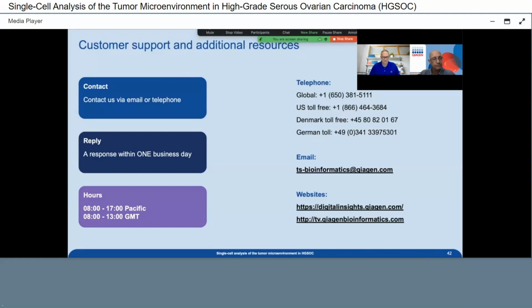Great. Okay. And then another question: can the general processes for comparing and contextualizing be applied to normal bulk RNA-seq data, or is that only for single cell data? Absolutely, for any type of data. This is an example of single cell because it's particularly trivial, particularly complicated, but we have done that many times for bulk RNA-seq. Yeah, absolutely. Microarray, anything you can imagine, even proteomics.